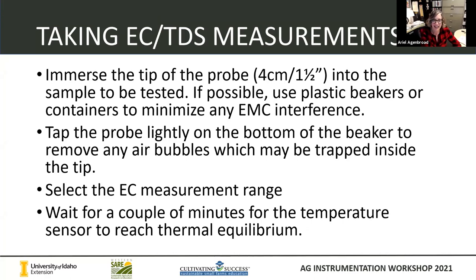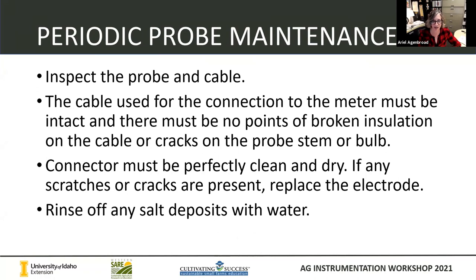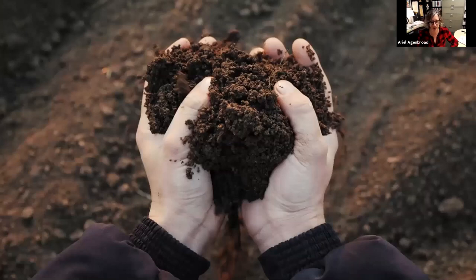For taking an EC measurement, it's very similar. You don't have to calibrate; however, you just want to start with a clean container, and if you can use plastic it's going to minimize any salt or electrical interference. Tap the probe lightly on the bottom of the beaker to remove any air bubbles, select the EC measurement range on your meter, and then wait a couple of minutes for the temperature sensor to reach equilibrium. To take care of your probe in the future: regularly inspect your probe and cable, make sure everything is intact with no cracks. The probe stem has glass inside, so you want to make sure that stays protected. The connector needs to be perfectly clean and dry, and if you get any scratches or cracks, replace the electrode.